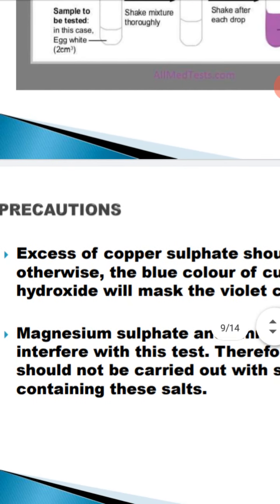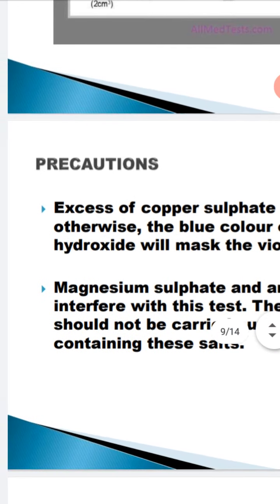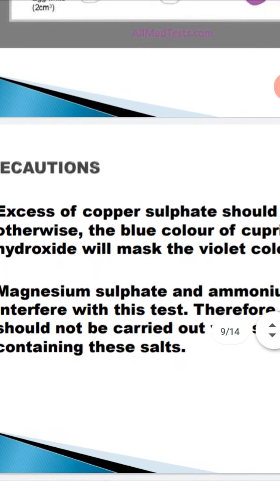And the second thing to remember is that magnesium sulfate and ammonium sulfate interfere with this test. So if we are doing the test, we should be very clear that the solution does not contain these two salts, that it should not contain magnesium sulfate and ammonium sulfate.